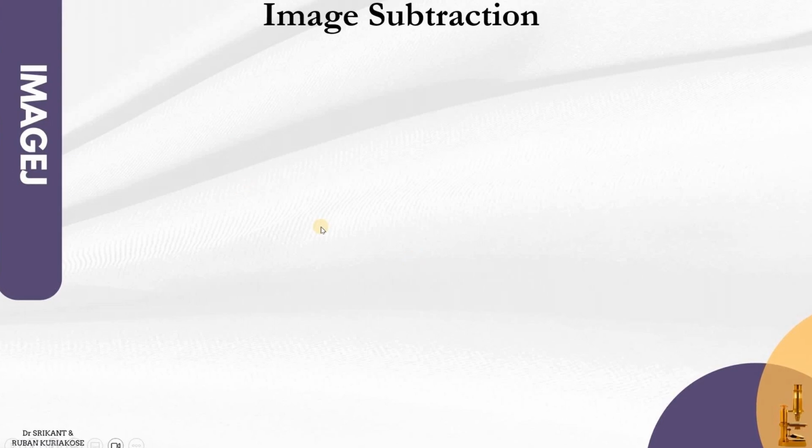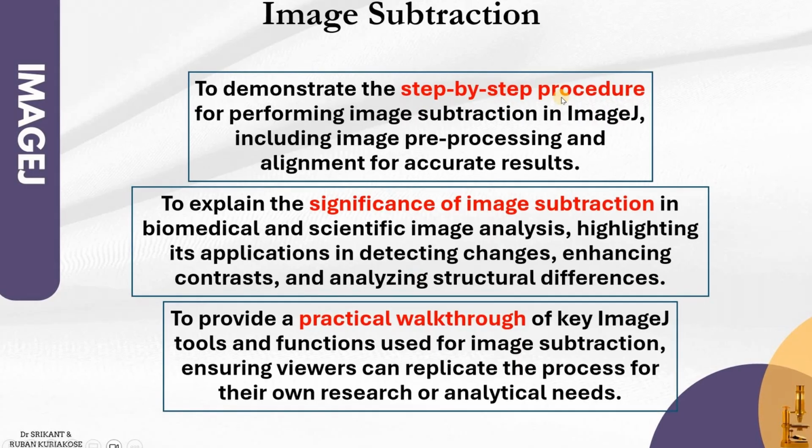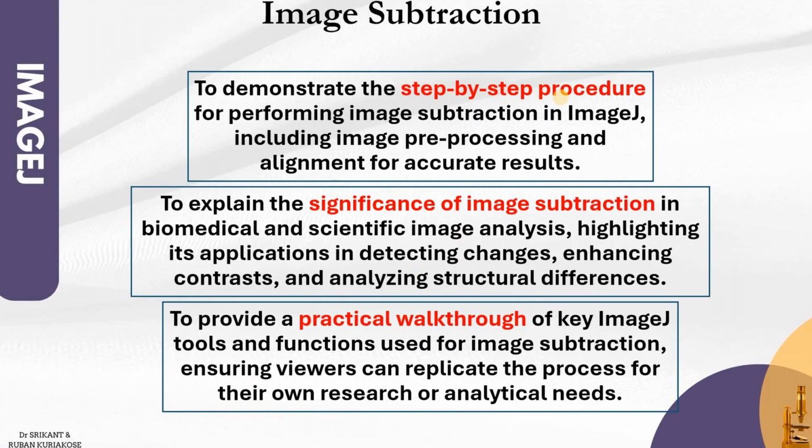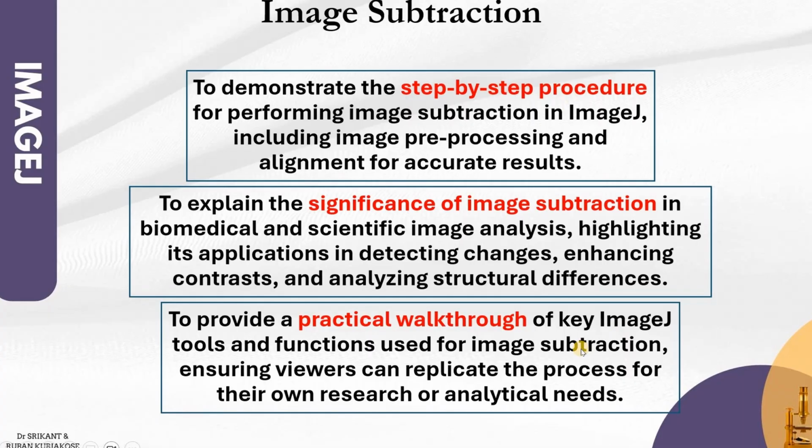In continuation with our ImageJ series, today we are going to learn about image subtraction. In this video, we will be demonstrating the step-by-step procedure to perform image subtraction, and we'll also give you some explanations as to when image subtraction is done. We'll give you a practical walkthrough of the key image tools and functions that are used for image subtraction.